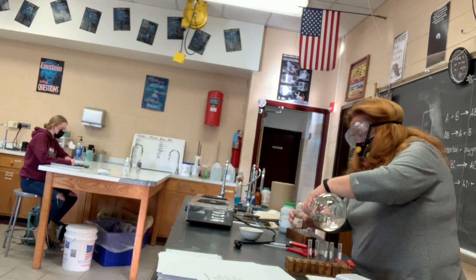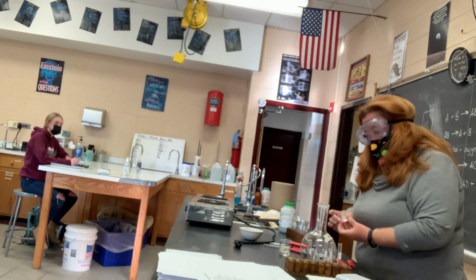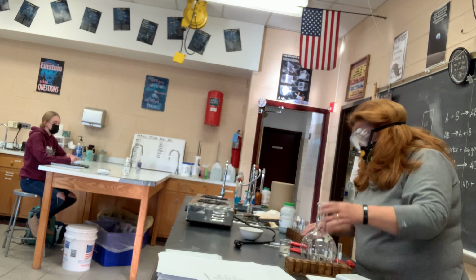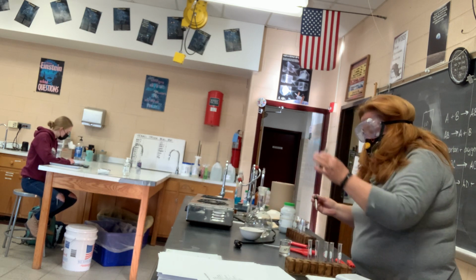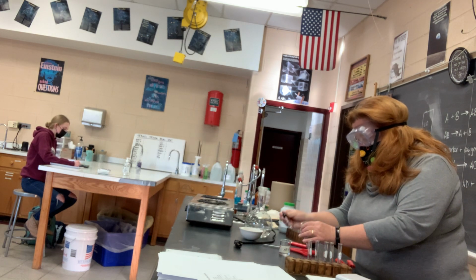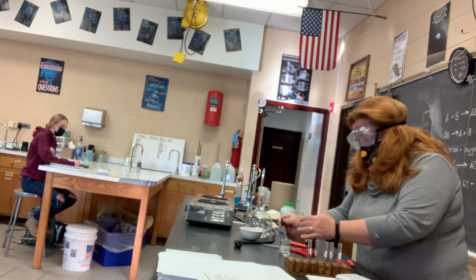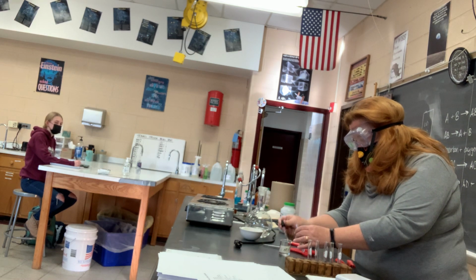The really strong stuff, like it's in your stomach, digesting your breakfast right now, is 12 molar. It's about half as strong. So I'm going to take my test tube, fill it up about halfway, it said, and then I'm going to drop a piece of zinc in.